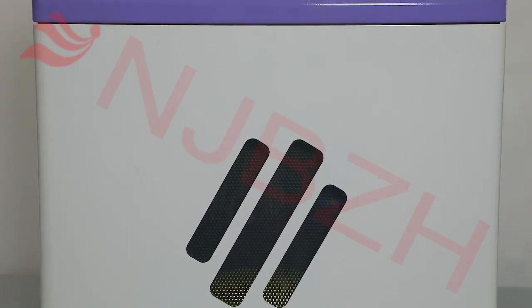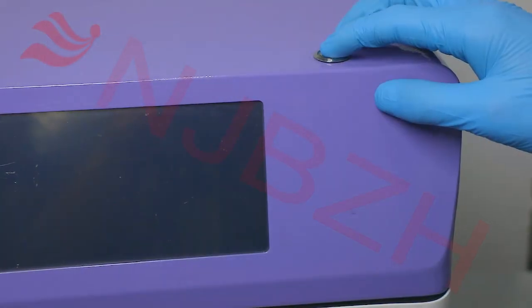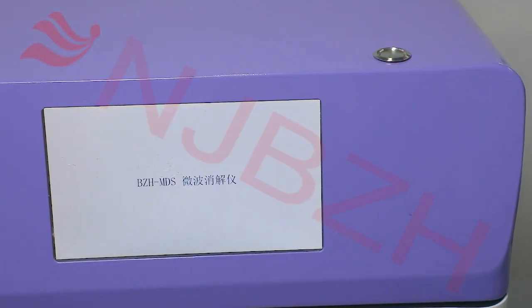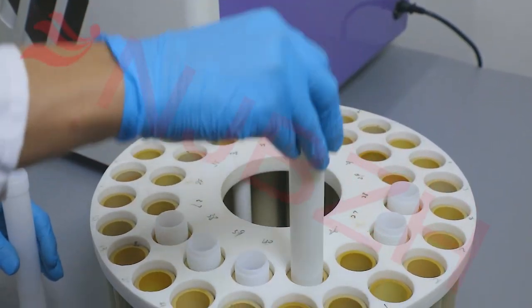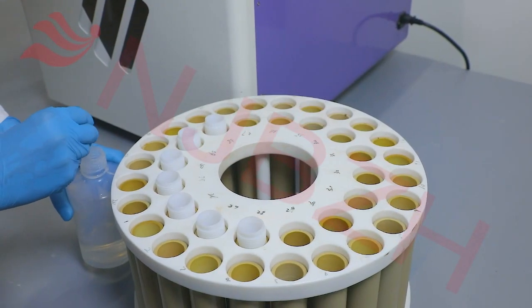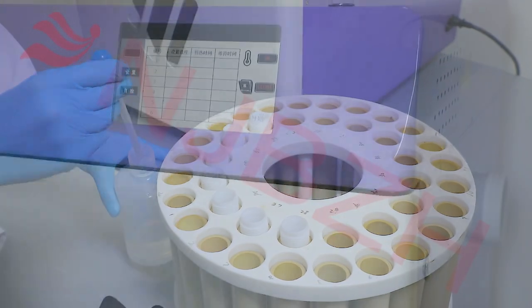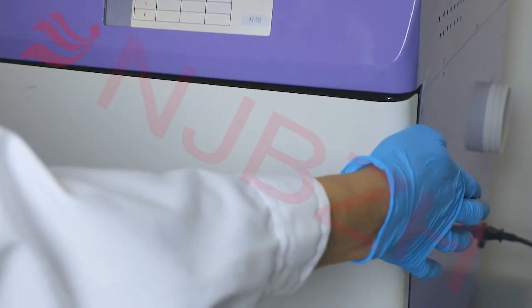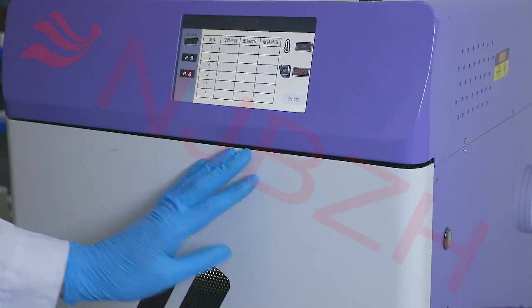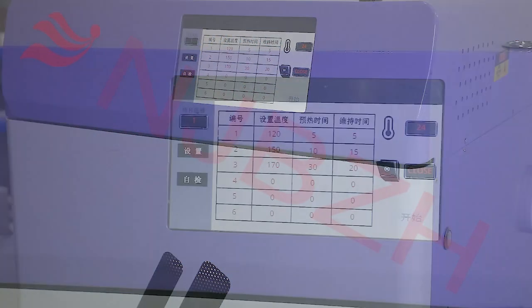A microwave digestion system can be used with a microwave digestion tank. It uses the principle of microwave heating to directly heat the sample in a closed digestion tank. At the same time, the amount of reagents used in the digestion process is small, the blank value is low, and the operation is simple, which effectively guarantees the integrity of volatile elements in the process of sample analysis and detection.